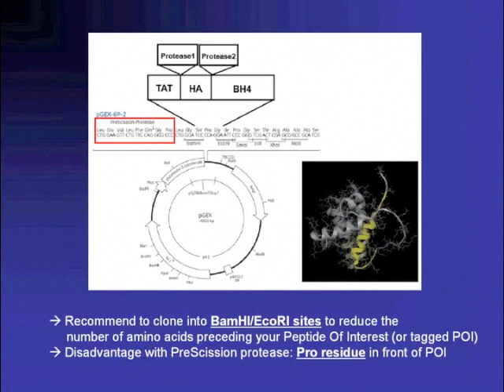That would be. So I actually have another question that may test your molecular biology as well. I promise we'll come back to the mini-genes. I have purified a cleavable His-tagged hydrophobic peptide. I have tried to cleave the His tag using the cyanogen bromide technique, but the cleavage has failed. Do you have any suggestions to cleave the His tag?